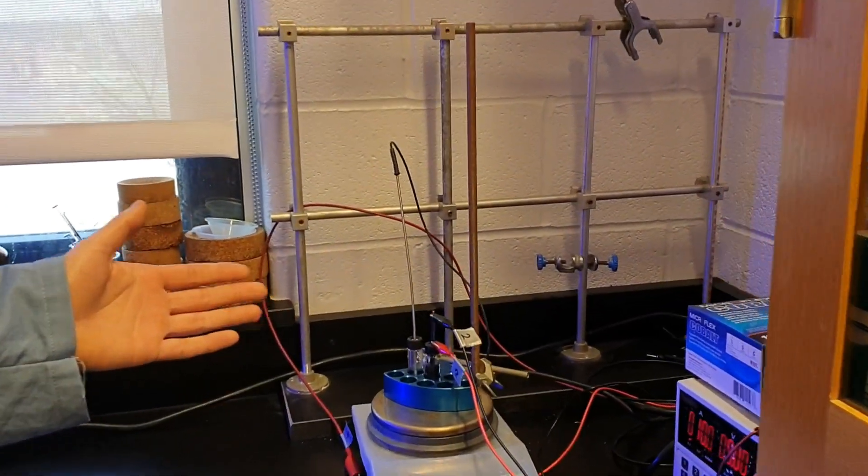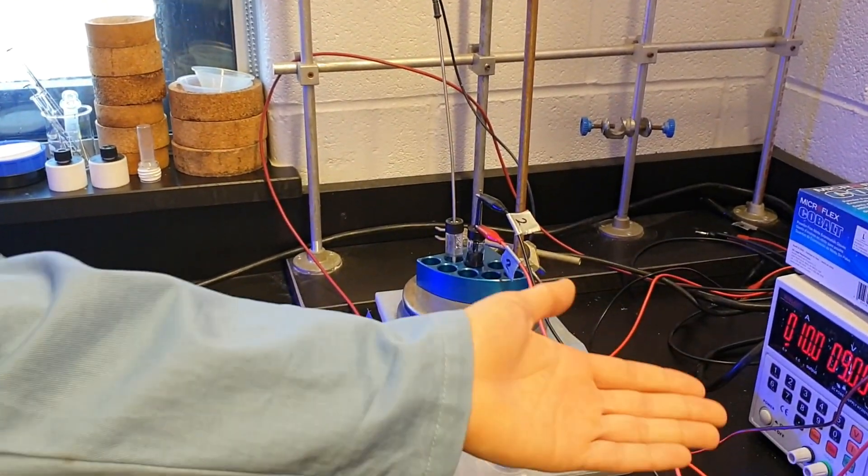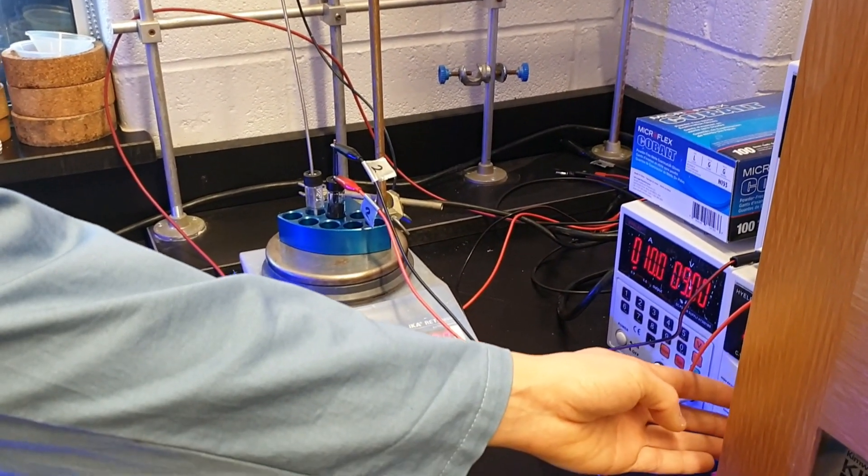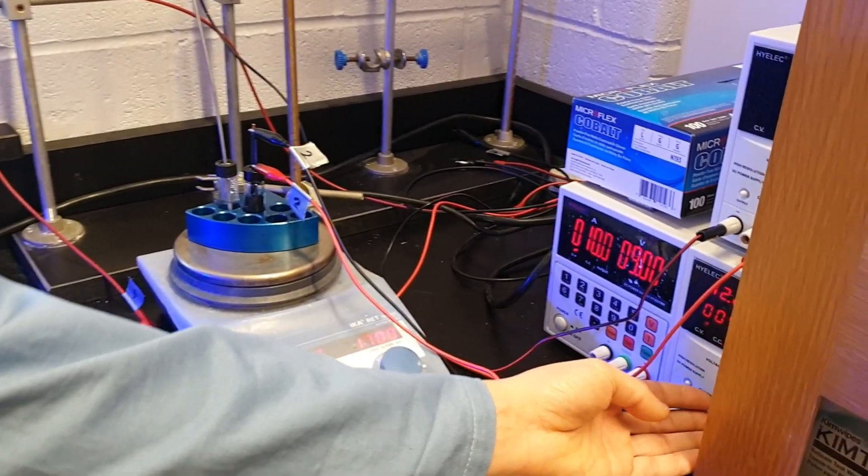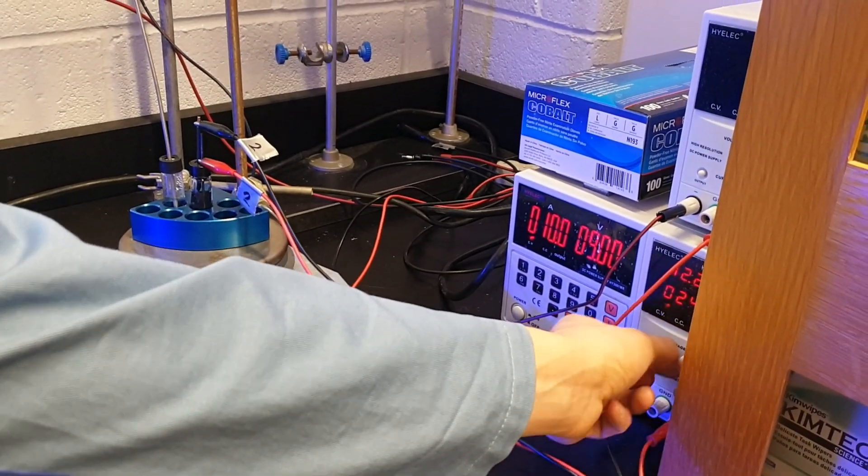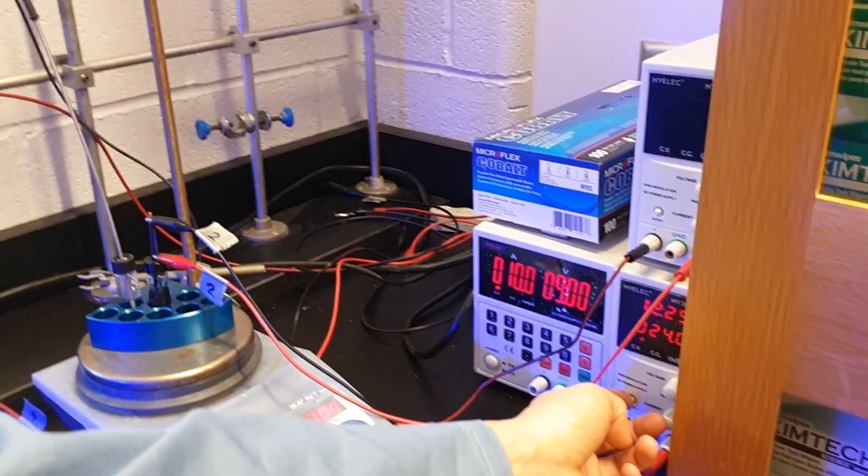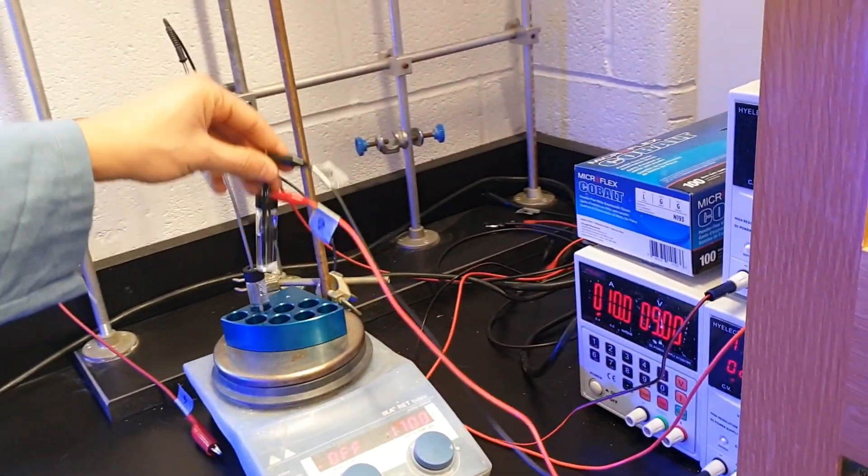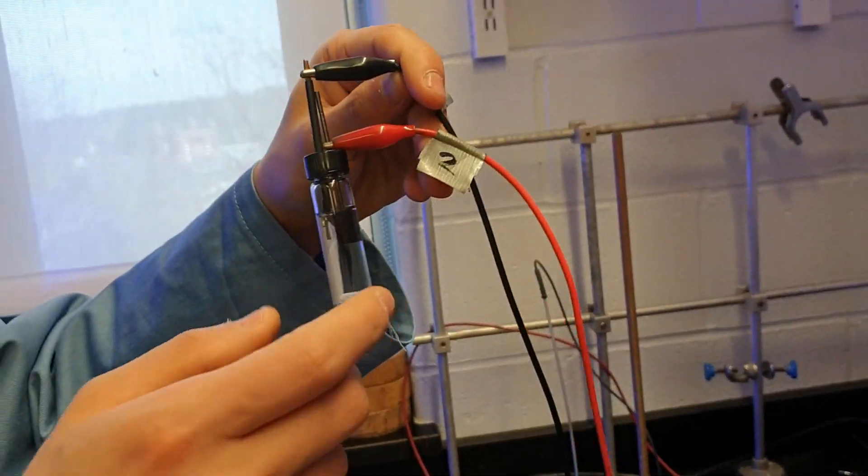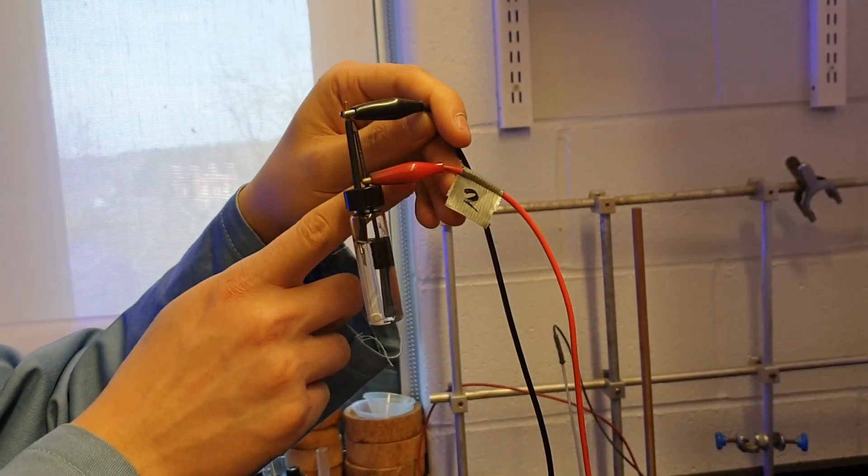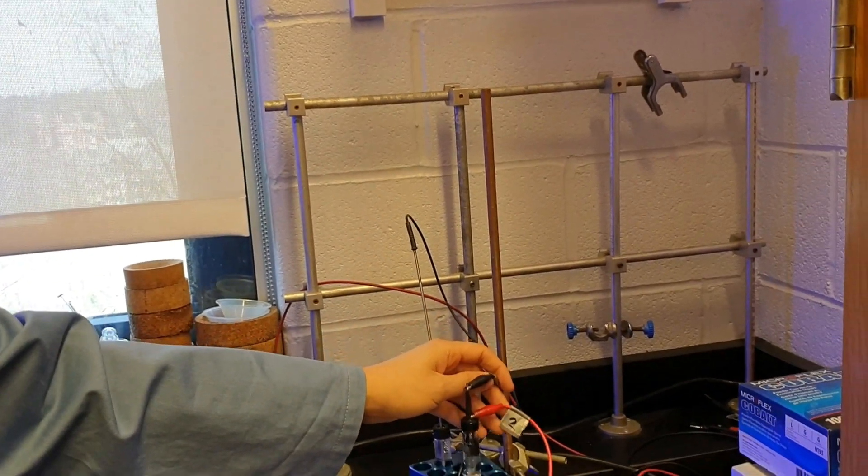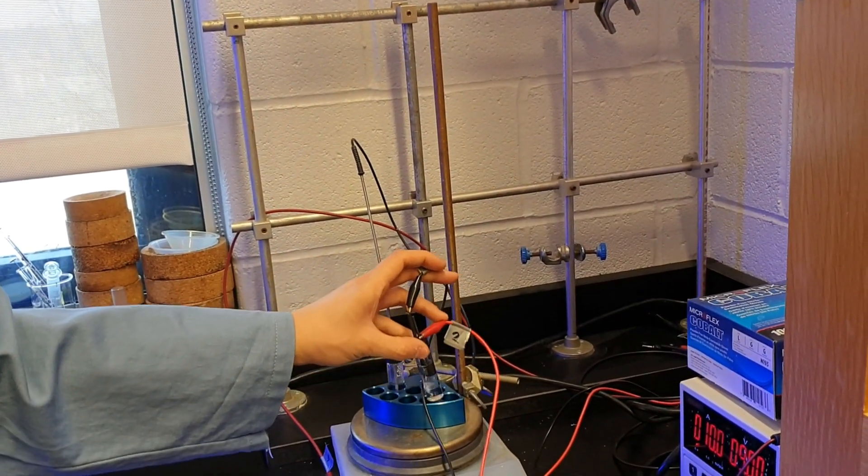The most simple setup consists of a potentiostat or galvanostat, you see there. You can dial in a current, then start the current, or dial in the voltage. The whole thing is connected to a cathode and anode, and you just set it up and electrolyze it. It's really simple to setup, and easy to get started doing chemistry.